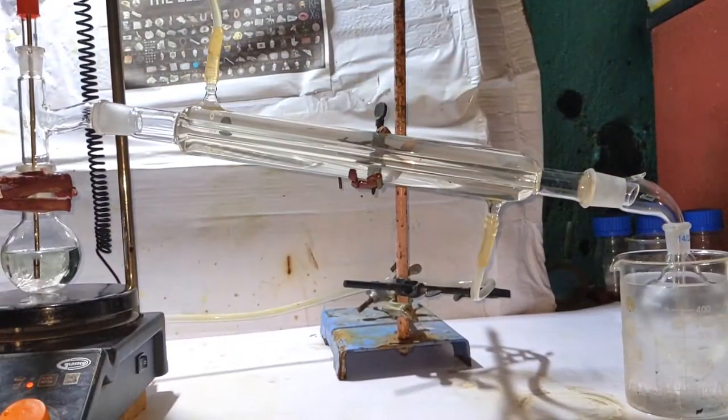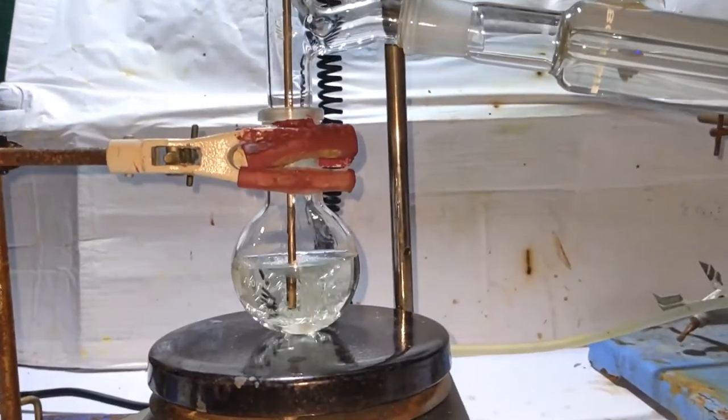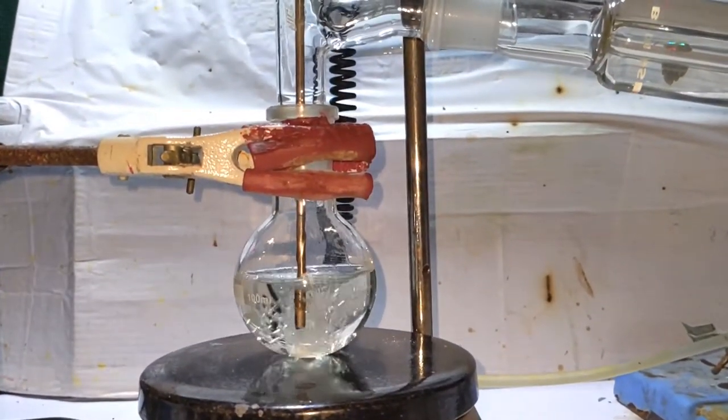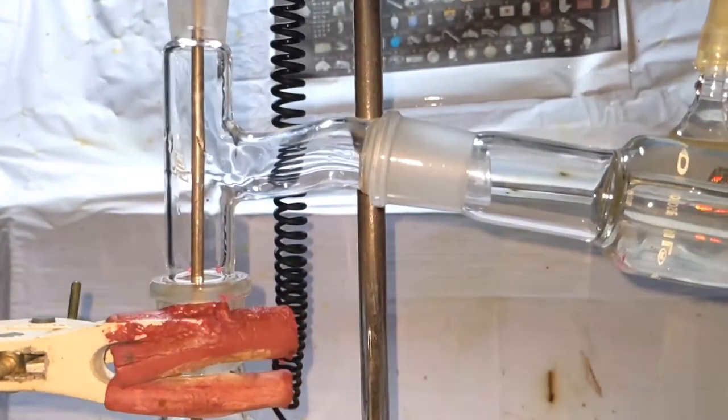After 30 minutes, we will set up the flask for simple distillation and collect everything below 100 degrees Celsius. This can also cause the distillation of water, which is not going to be a problem because we will be removing that in the upcoming steps.